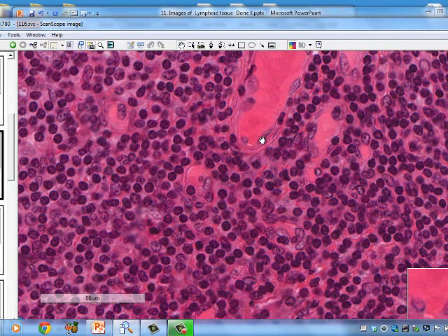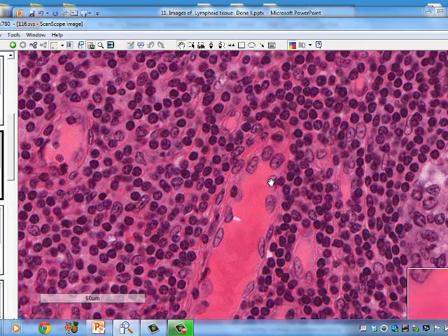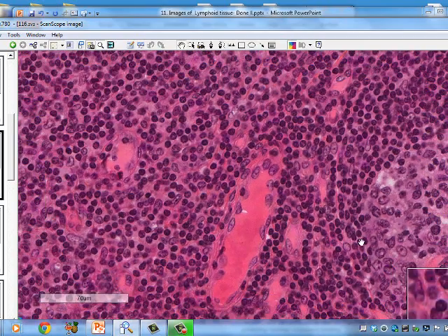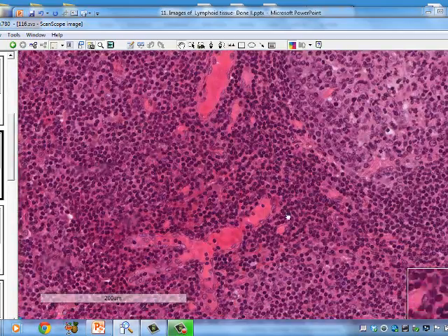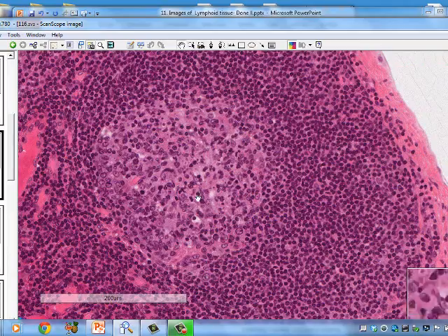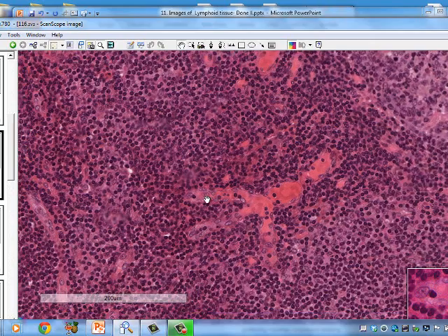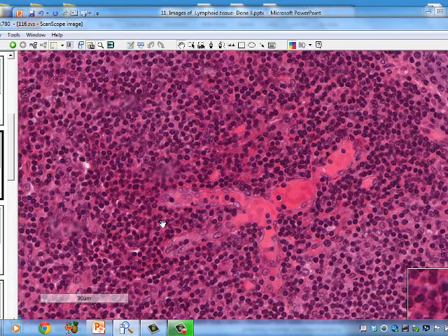This here is a typical endothelial cell, and then these are the high endothelial venules. In fact, that's what these are, guys, right here, are high endothelial venules. There, and that's right in the parafollicular region. And so the cortex, the follicle, germinal center, parafollicular region is where you have these high endothelial venules. And this is the source of T and B lymphocytes coming out of the blood and going into the lymph node.